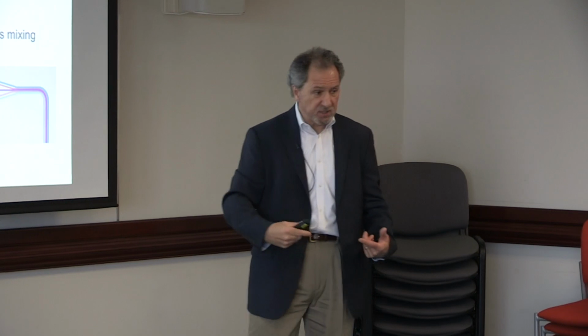And if you were to watch this in real time and follow some particular volume as it progresses down the channel, you would see eventually at the interface you start to see a little mixing. But that mixing is only diffusion based. It has nothing to do with turbulence in the channel. In other words, microfluidics gives us the opportunity to now mix things and not have them mix. That can be a blessing, but what if you now have 2 reagents and you want to mix them? Then that's a curse. So, interesting phenomenon. It's a physical limitation that we have to deal with.